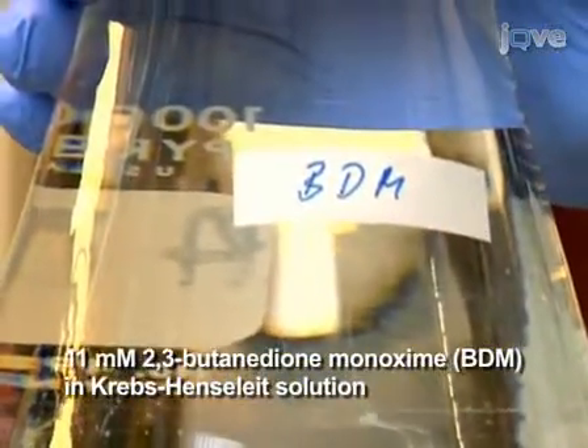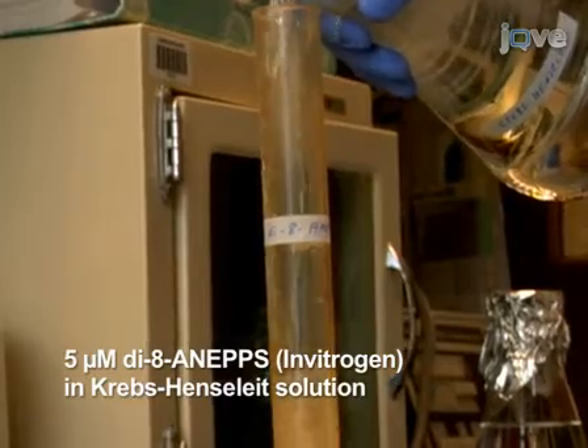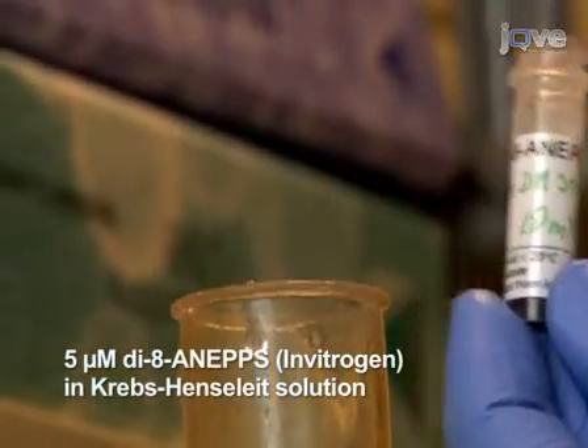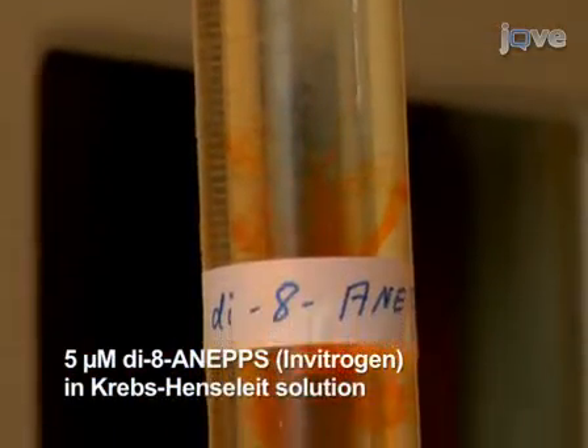First, use 1 liter of the prepared Krebs-Henseleit solution to dissolve 11 millimoles of BDM. Second, take another 100 milliliters of Krebs-Henseleit and mix in 10 millimolar Di-8 ANEPS in DMSO to a final concentration of 5 micromolar Di-8 ANEPS in solution.